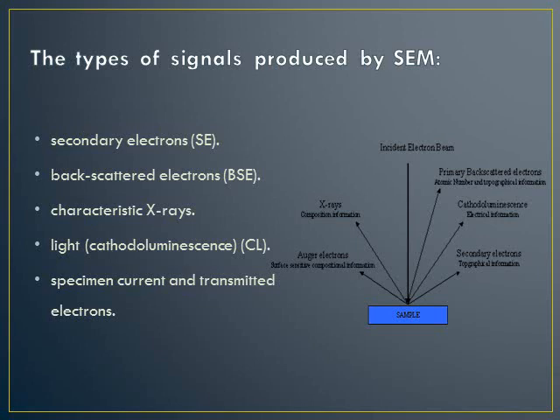Backscattered electrons are beam electrons that are reflected from the sample by elastic scattering. BSE are often used in analytical SEM along with the spectra made from the characteristic X-rays. Because the intensity of the BSE signal is strongly related to the atomic number of the specimen, BSE images can provide information about the distribution of different elements in the sample.